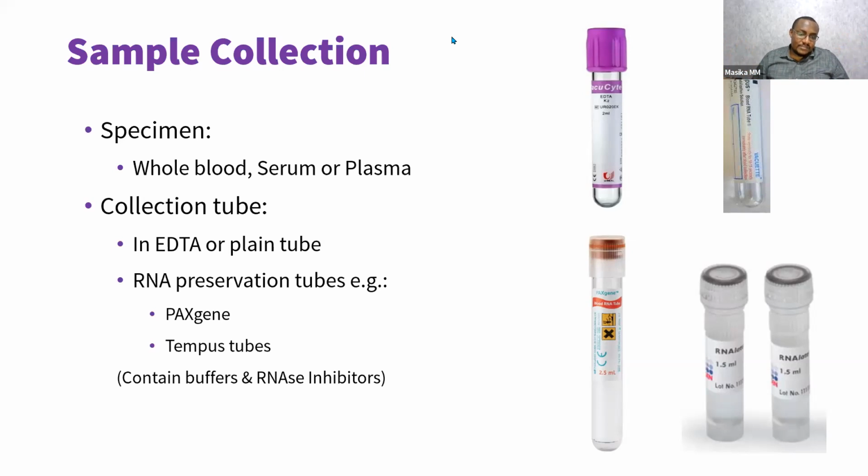What do you mean saying the primers aren't incorporated into DNA? Yes, they are, but not all of them, because they are in excess. But they will still attach. They will still anneal. But if they are not extended, they will not be part of the new copies, because there is a lot of primer, and sometimes they even bind to each other. It is called primer dimers. So the primers are there, they will bind and anneal, and keep binding and releasing until they are used up. And sometimes when they bind to each other, they release, and next time they can bind to something else.